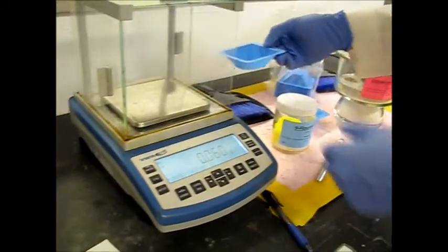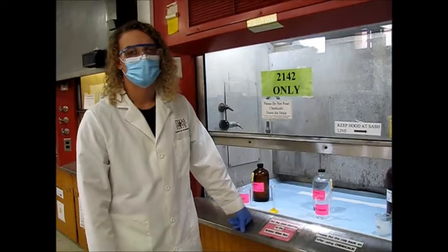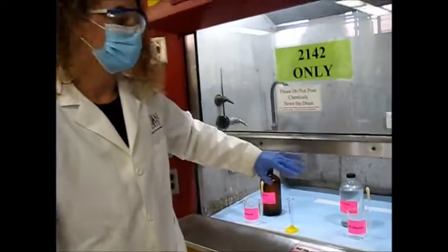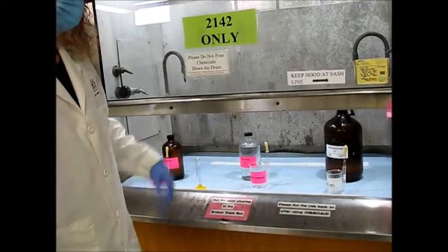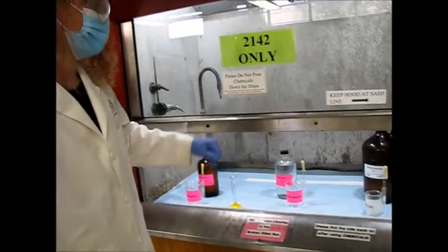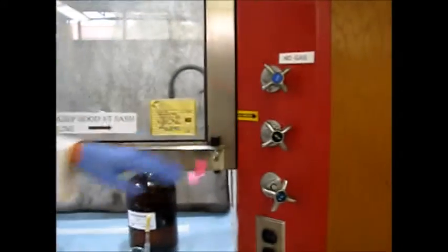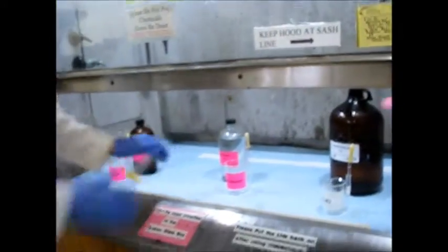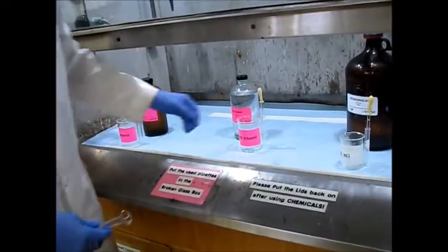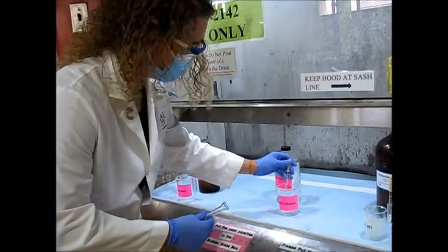Next we'll go ahead and measure out the volume of ethanol for our solvent. We normally keep all of our liquid reagents in the fume hood for y'all to measure out. It is important whenever you're getting your chemicals that we keep this hood below the sash height. It says it right here. We need to make sure that it's at or below this line. These are all of our liquid reagents we're going to use for this lab. Right now we just need ethanol. So we're going to go ahead and get 2.5 milliliters of ethanol.